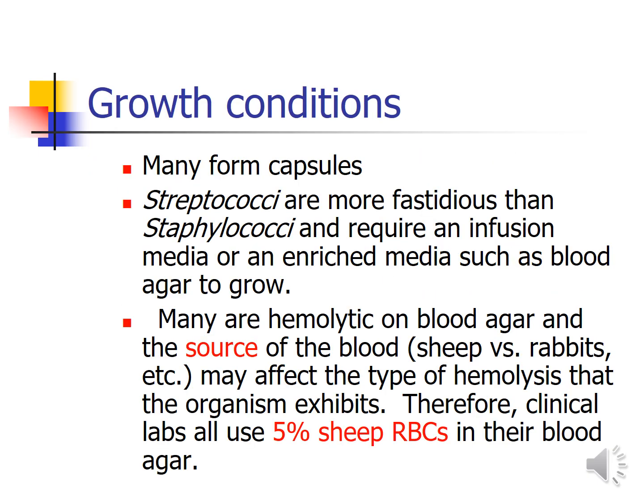Growth condition. Many of the bacteria form capsules. Streptococci are more fastidious than Staphylococci and require infusion media or enriched media such as blood to grow.